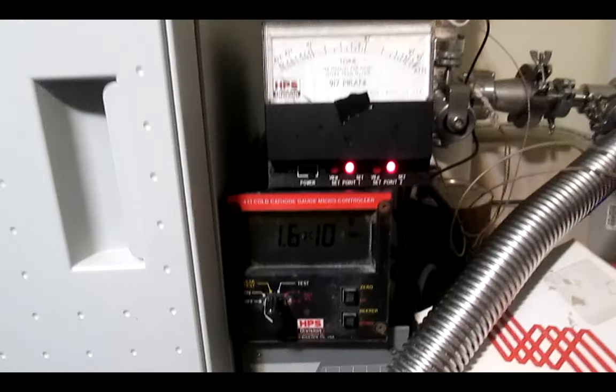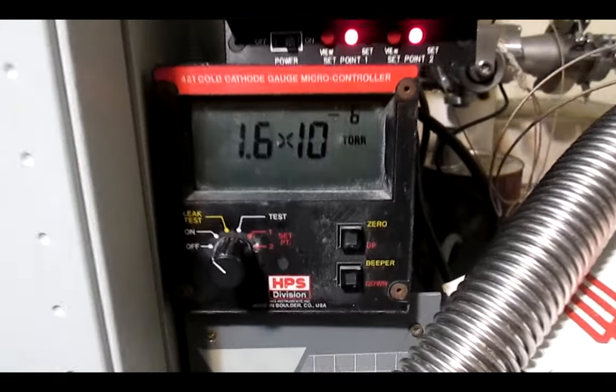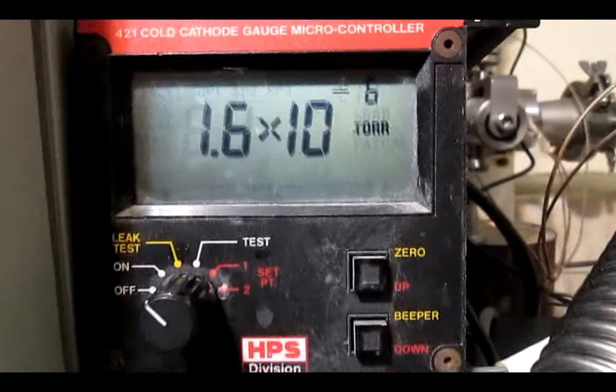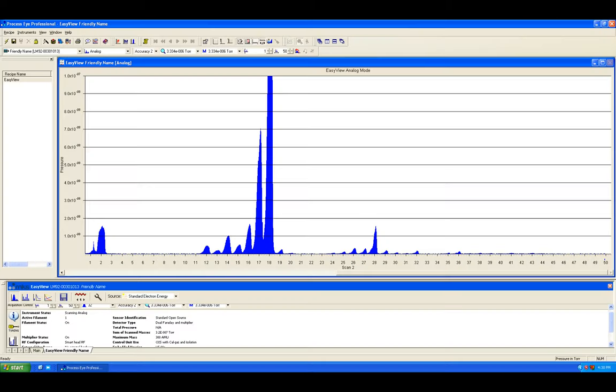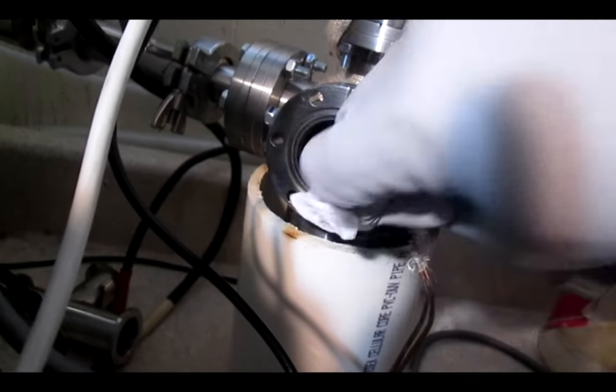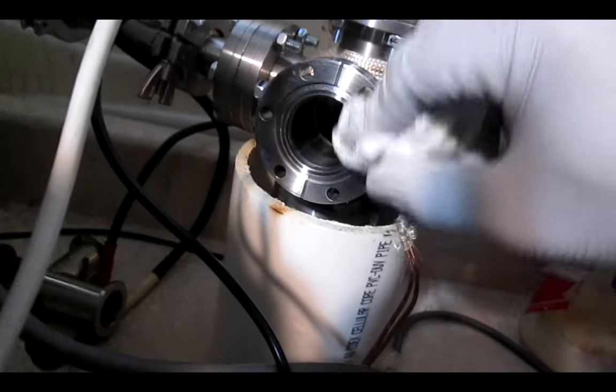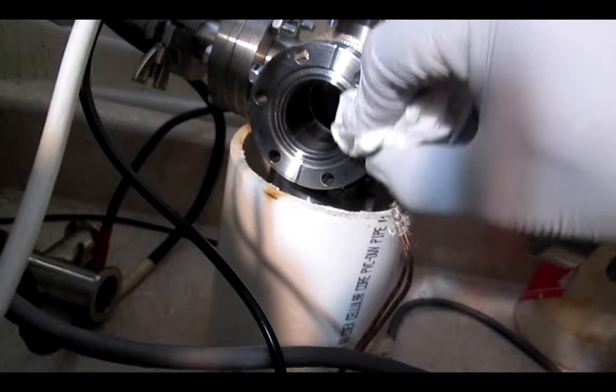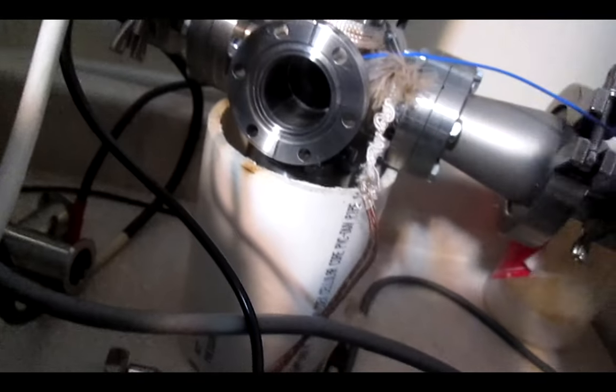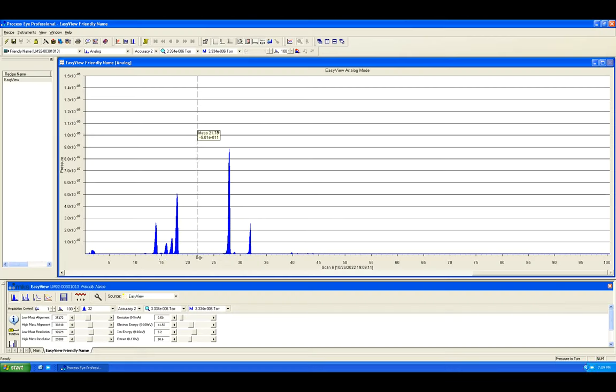So here's a few preliminary results. At about 10 to the minus 6 torr, the large peak at mass 18 is the water contribution. Water is especially difficult to get rid of in high vacuum, and baking and degassing are the best options for this common problem. The rest is pretty much an isotopic analysis of the air we breathe.